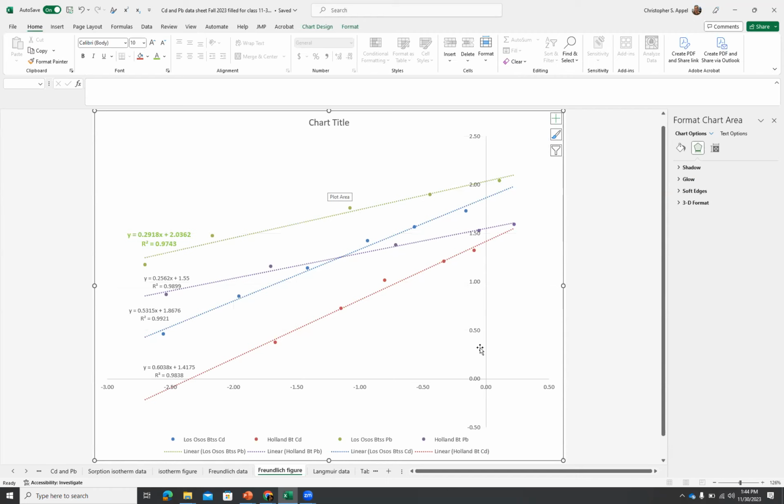All right, I got a couple of suggestions kind of off the bat: move the y-axis over to -3, so it's on the far left, and make your x-axis end at 0. Okay, so let's talk about how to do that.